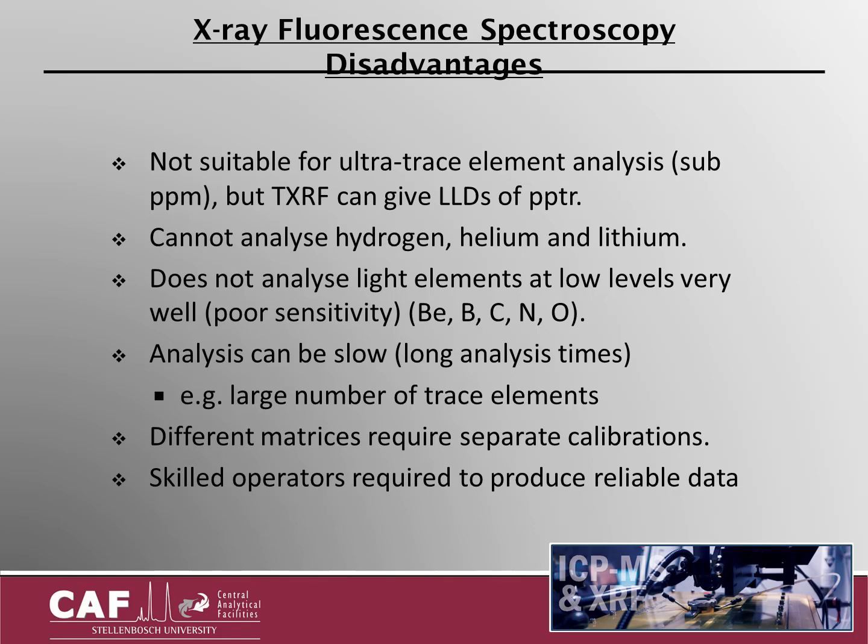The analysis can be slow with long analytical times, especially for a large number of trace elements. Different matrices require separate calibrations, and a skilled operator is required to produce reliable results.